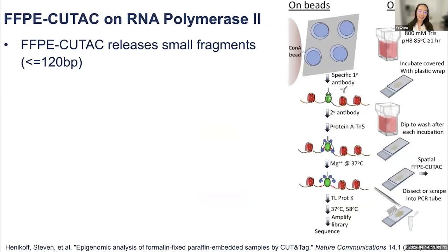So with that, previously there were usually two commonly used assays to profile FFPE tissue, either whole genome sequencing or RNA-seq. However, both of them are very affected by the degradation in FFPE. In other words, the DNA and RNA molecules will be chopped up within the cell.